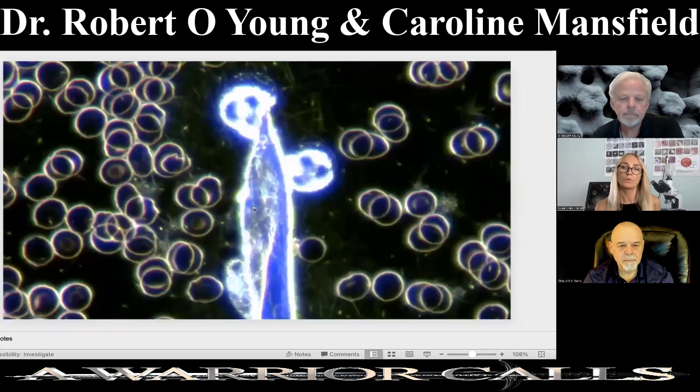And we also get what we call hydrogel structures. These are quite familiar for people who've been looking at this work recently. And we get the white blood cells trying to degrade these structures.